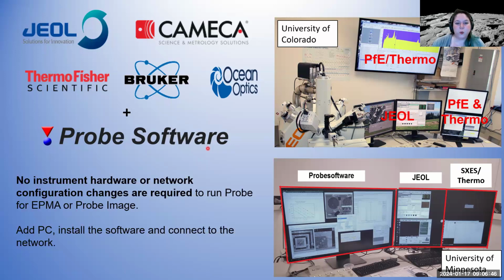So essentially you get like a race car, and if you really want to push it to the limit, you also need a software that can really give you access to all the possibilities there. The nice thing with the probe software is that it can just run alongside the main software, so we can switch back and forth. There's no modifications needed, and we just have it running and have a dedicated screen for it.